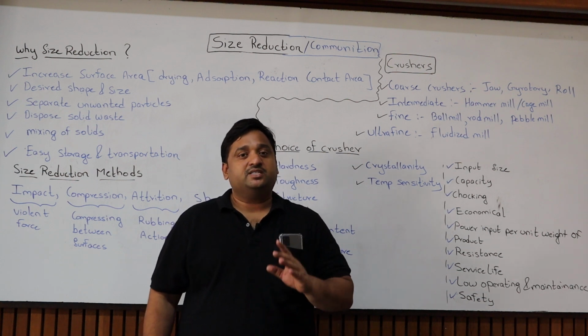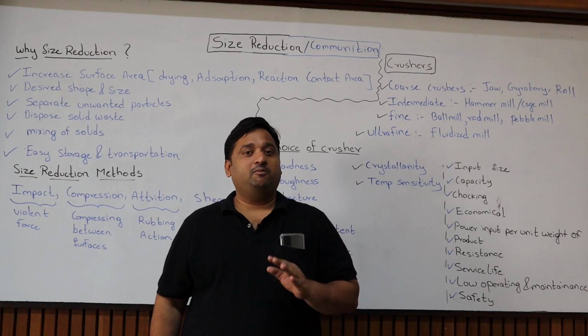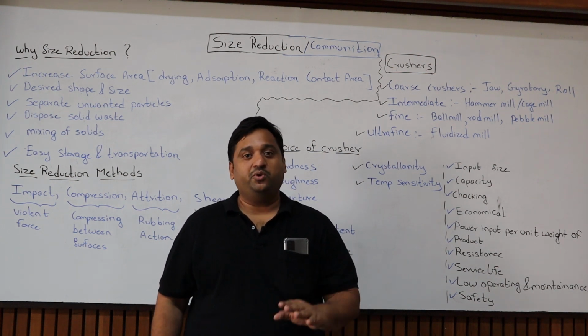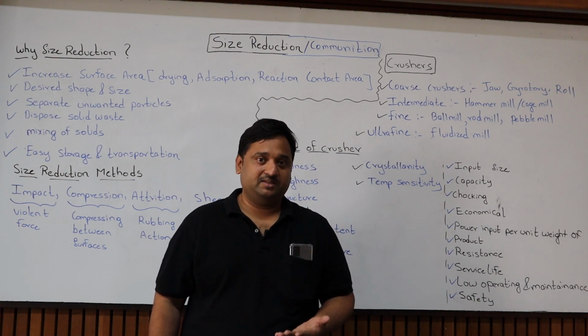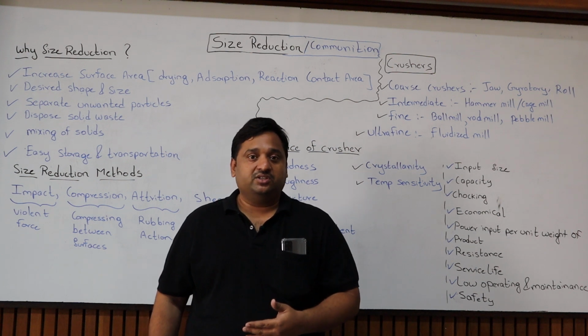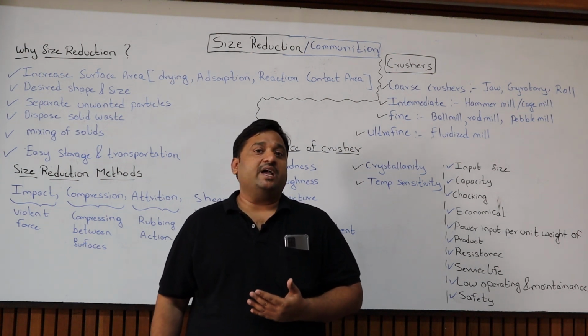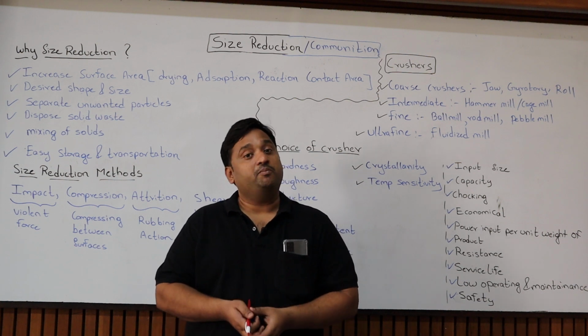Today we are going to discuss size reduction methods, and I am going to take you to the lab and show you the different crushers or grinders that are available with us. Before we go into the crushers, we should talk something about size reduction. The other name for size reduction is comminution.